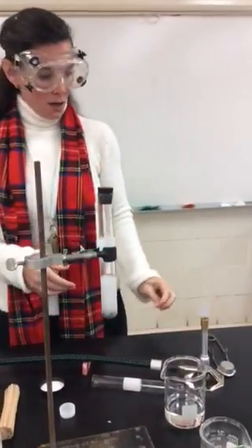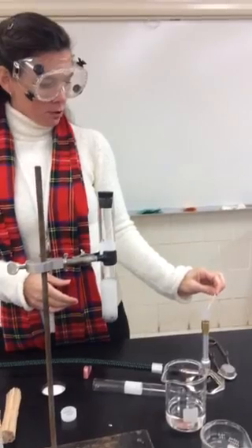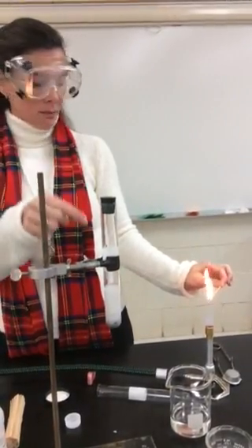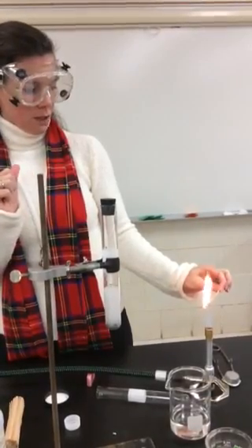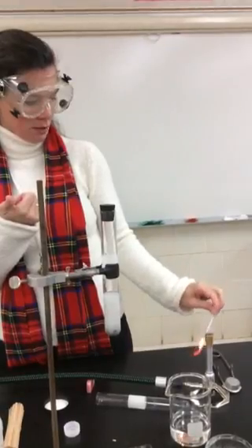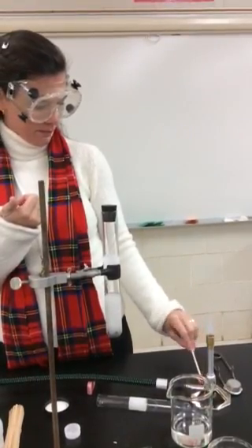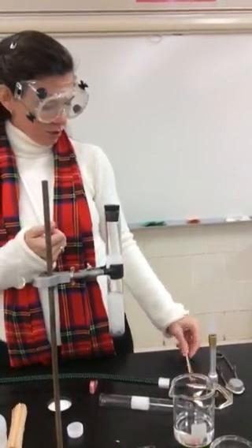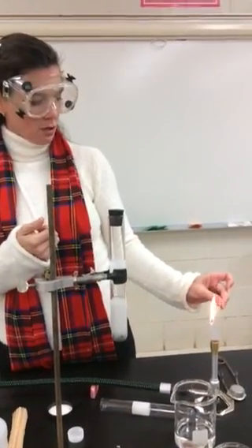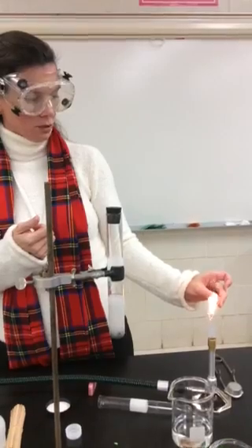There it goes. There are three different options. I'm going to take a burning splint, and when I put it into the mouth of the test tube, if it snuffs out the flame, then that is indicating the presence of carbon dioxide. If it starts to burn brighter, then that's the presence of oxygen. And if you hear a pop, then that is hydrogen gas.